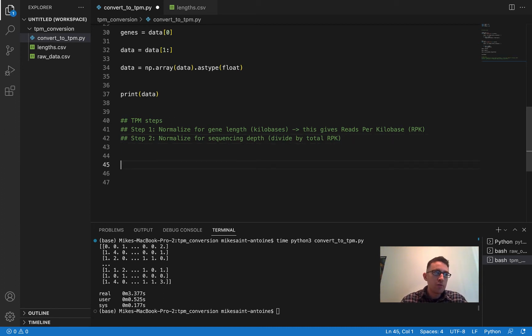So again, if you guys are confused at this point, first of all, I recommend checking out the StatQuest video, and secondly, I think this will make more sense when we actually implement it in Python, so you can actually see what's happening. Okay, so let's just start with step 1 here.